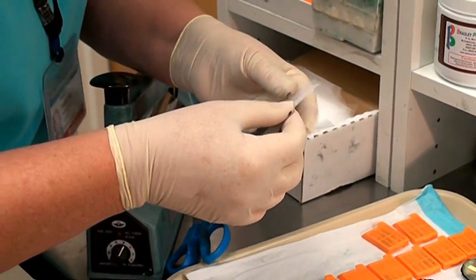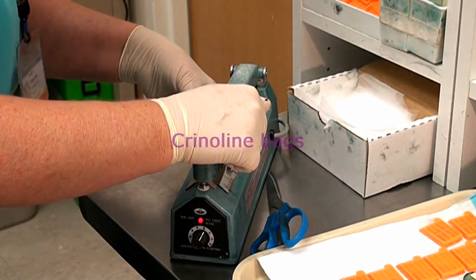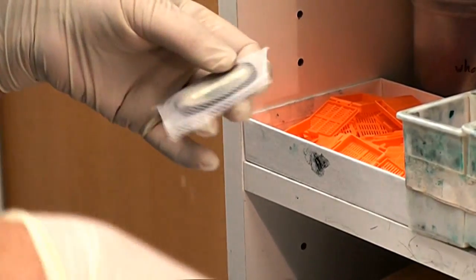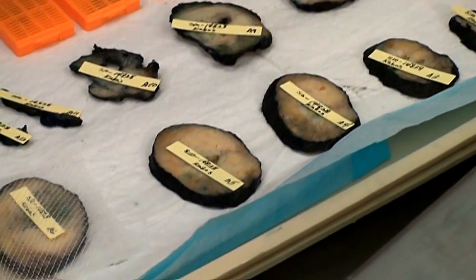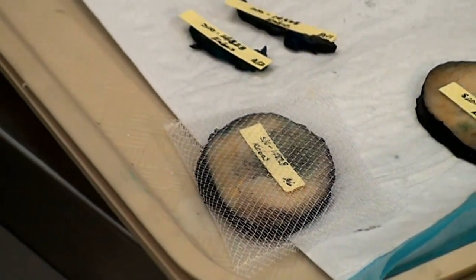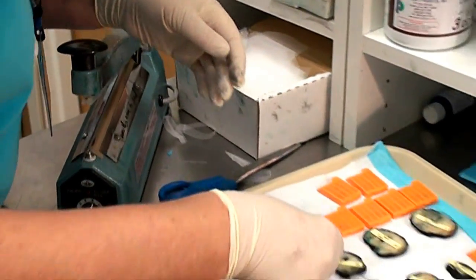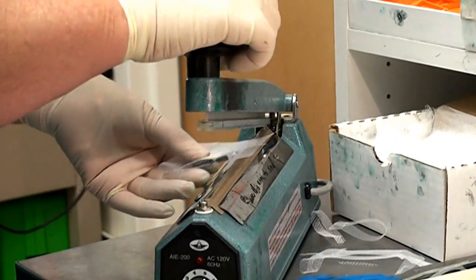We use crinoline that you get at a fabric store. We make little bags with a heat sealer and put the tissue in that — it stands up to all the acid, alcohol, and xylene on the processor, and it comes through beautifully. C-R-I-N-O-L-I-N-E. It's very similar to the nylon knit in wedding gowns for the bride's veil, except crinoline's a little stiffer and it looks better with the heat sealer. We're going to seal this on three sides with the sealer.